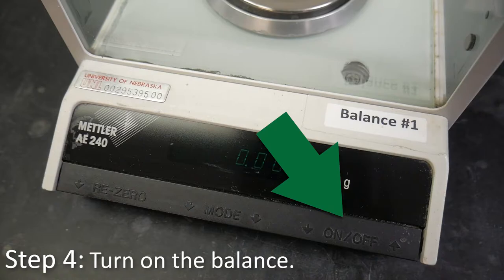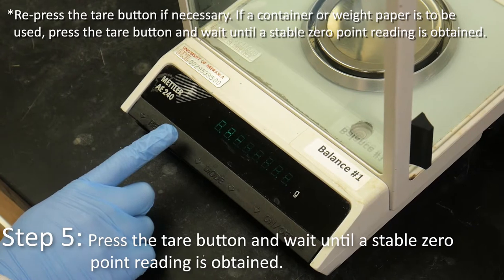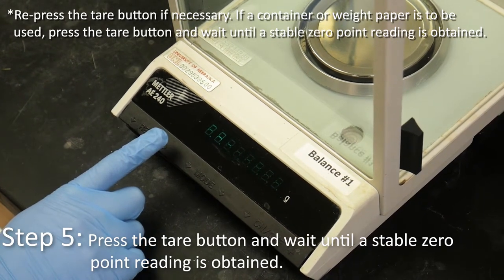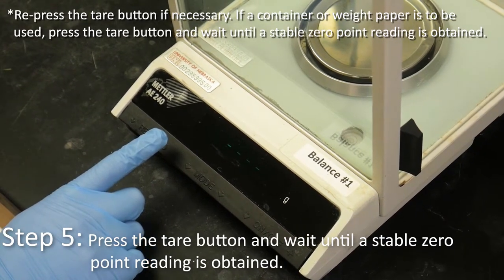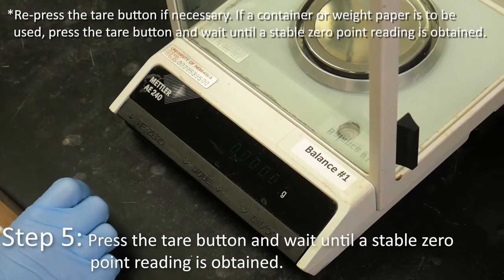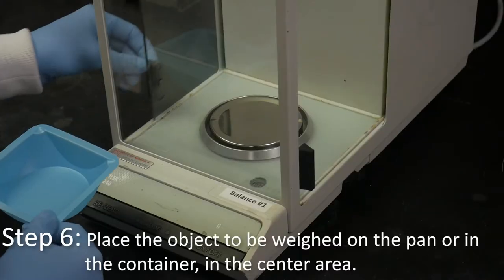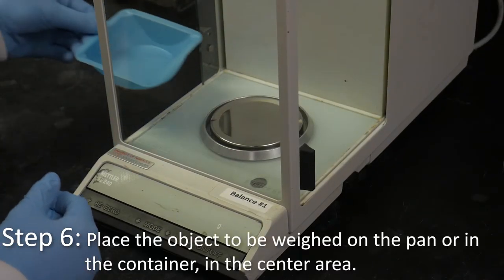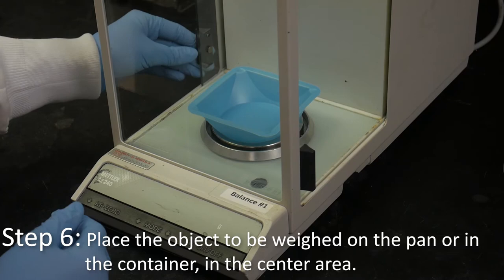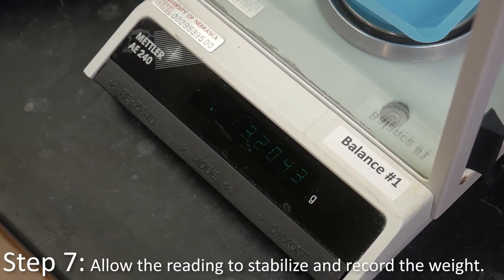Turn on the balance. Press the tare button and wait until a stable zero point reading is obtained. Repress the tare button if necessary. If a container or weight paper is to be used, press the tare button and wait until a stable zero point reading is obtained. Place the object to be weighed on the pan or in the container in the center area. Allow the reading to stabilize and record the weight.